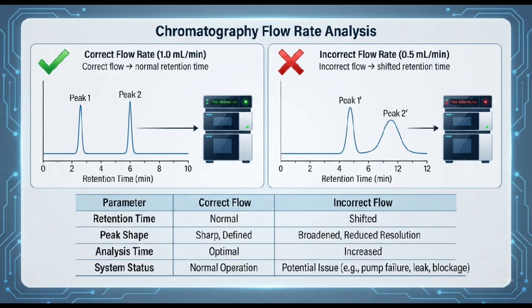Why flow rate matters? Why is flow rate so important? Because flow rate directly influences chromatographic behavior. A significant difference between programmed and actual flow can affect retention time, resolution, peak shape, pressure, and ultimately analytical performance. Therefore, accurate and consistent pump delivery is essential.